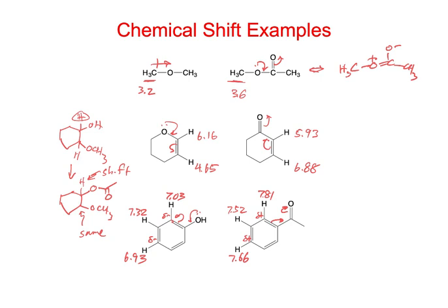So with the bottom example, there's a partial positive on the ortho and para position. Why on the ortho? Because wouldn't the double bond just change sides and it'd be the same environment for that carbon? Which one, the right or the left? On the bottom, you mean? Yeah, this bottom one.